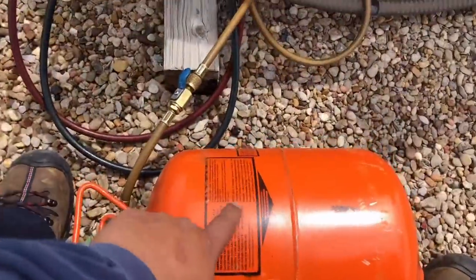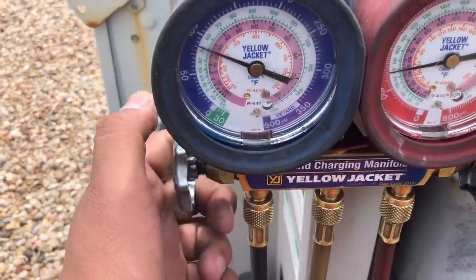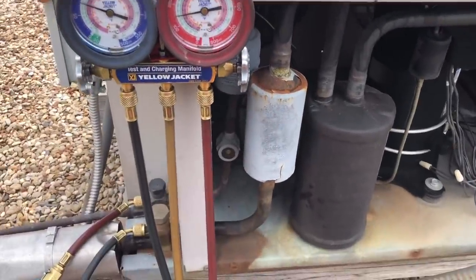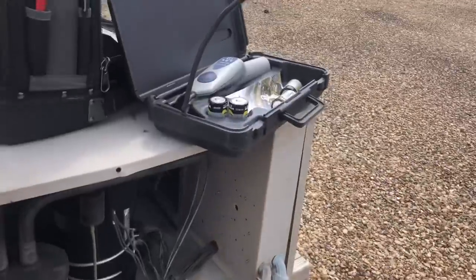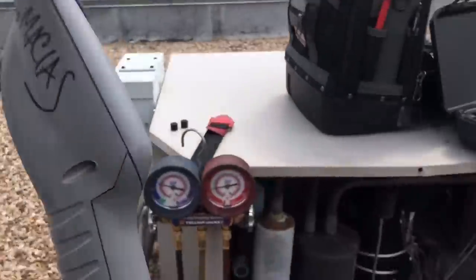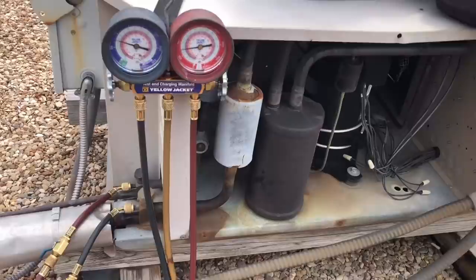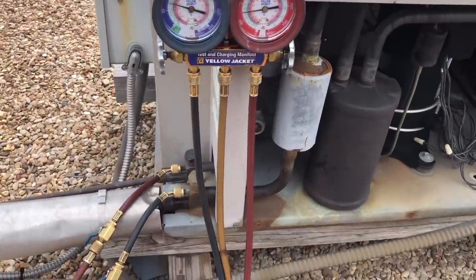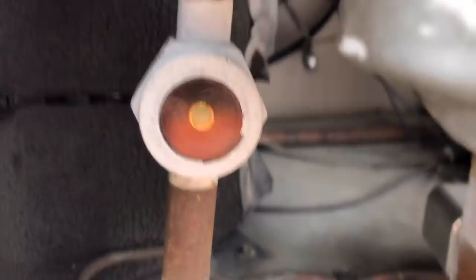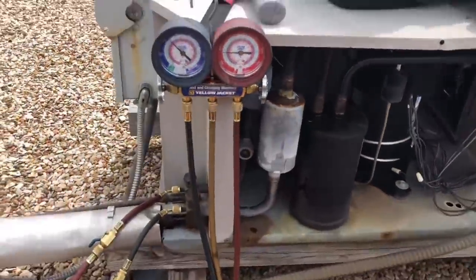Remember, 400-series refrigerants go in as a liquid, so we're going to try to meter it in as much as possible and let it suck in until we clear that sight glass. Once we do that, we'll use this D-Tech TechMate to see if we have any leaks. We've added a little bit of refrigerant — not a whole lot.